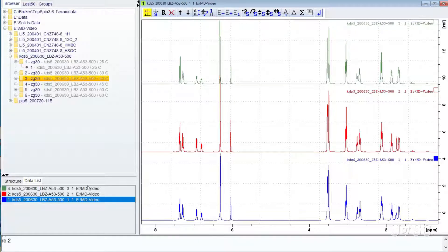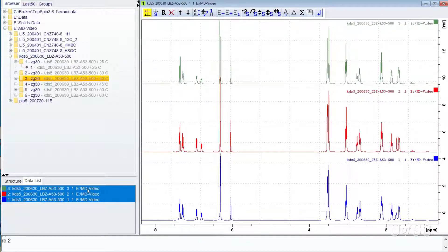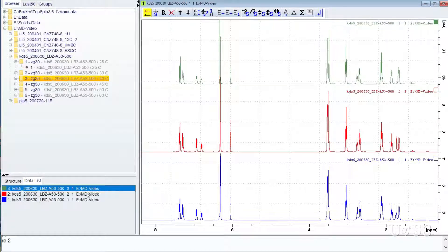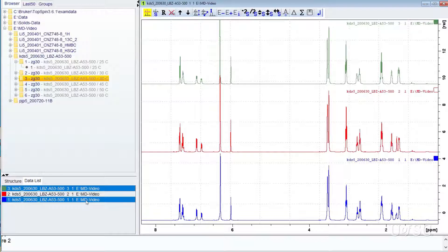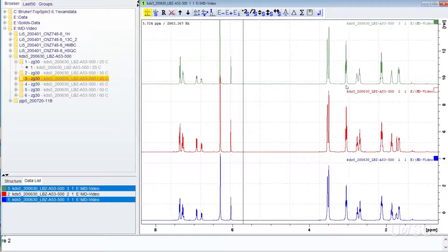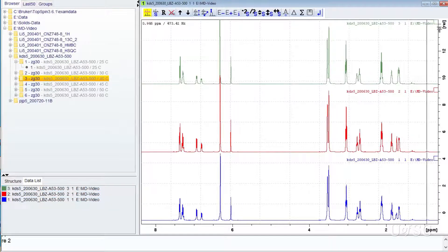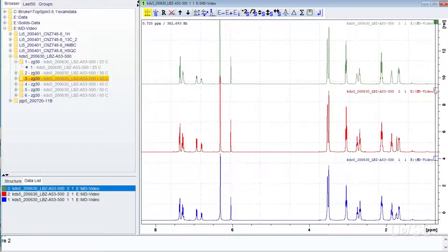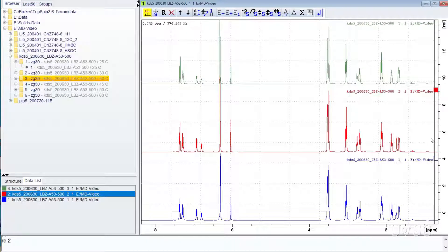You could also hold the shift or control keys to make consecutive or non-consecutive selections. You could also select a spectrum by clicking near or on the small box above the trace.